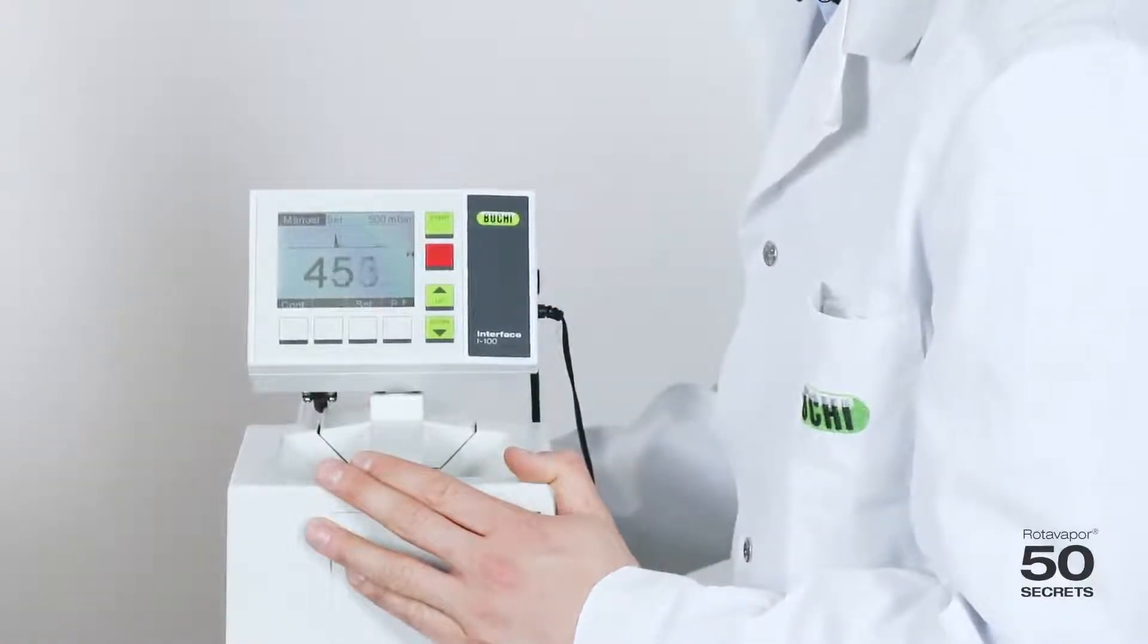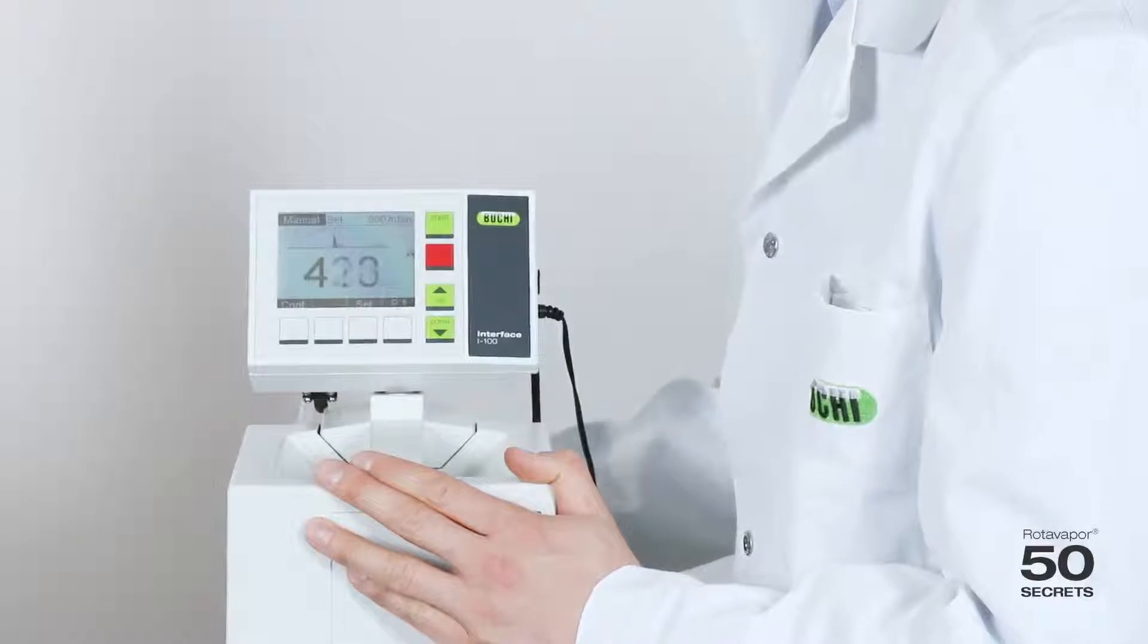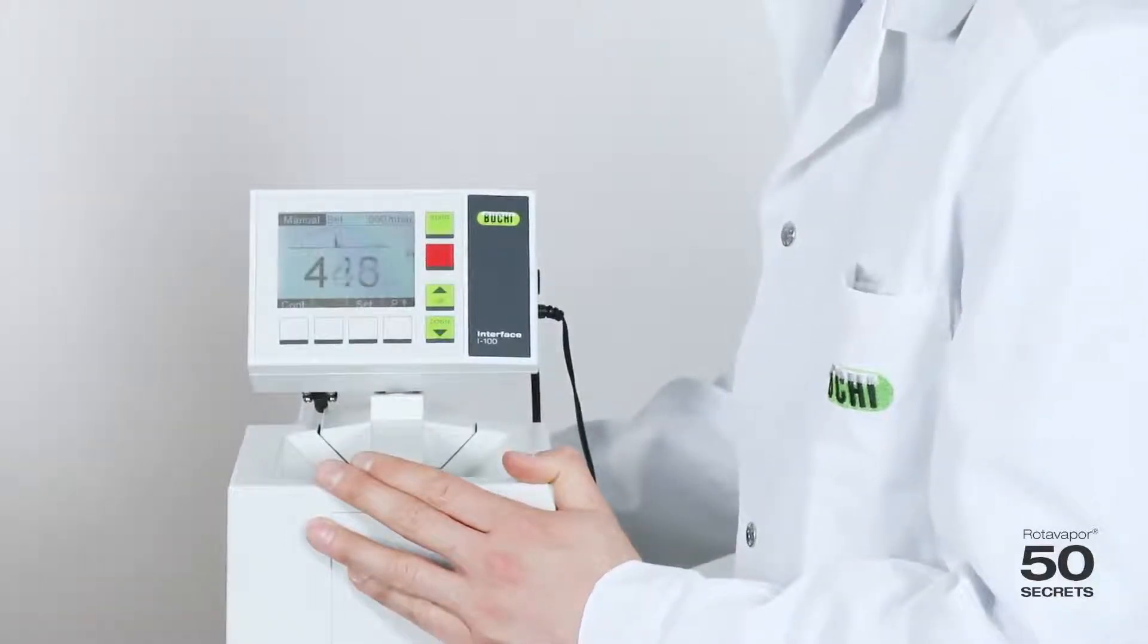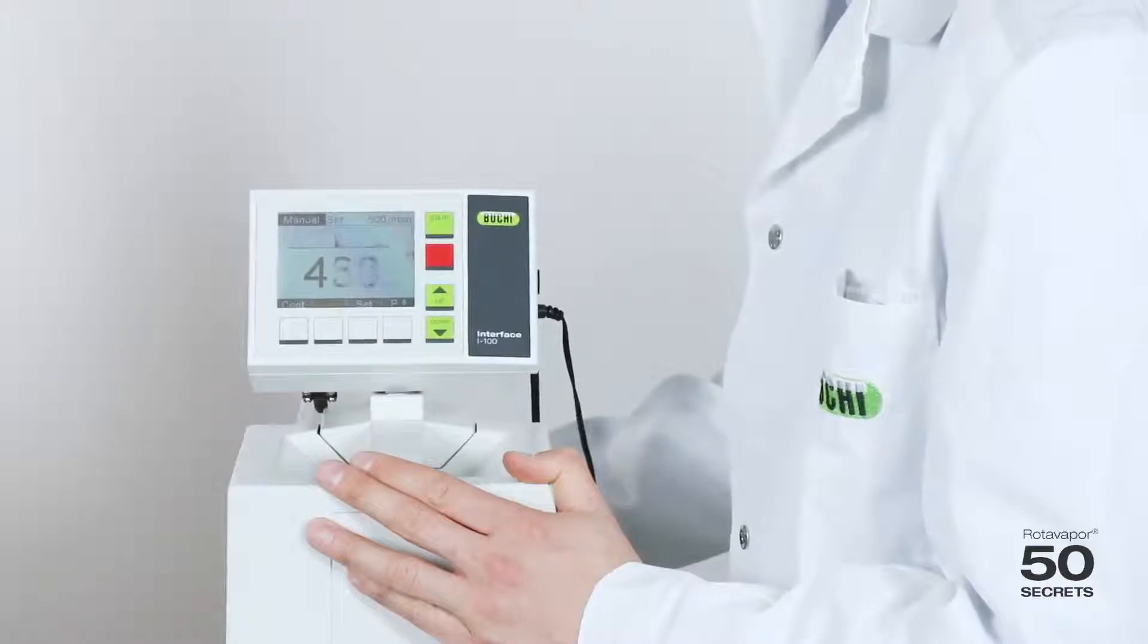Let's have a look. That's how it sounds. Let's go on to the V300 vacuum pump.